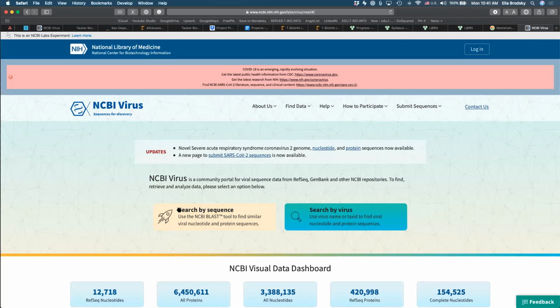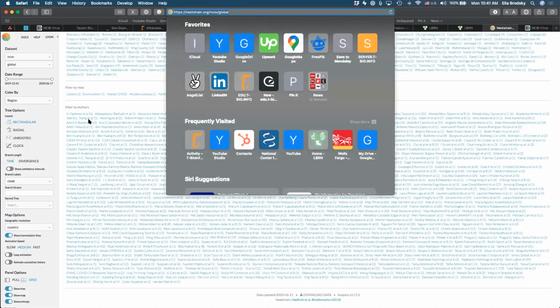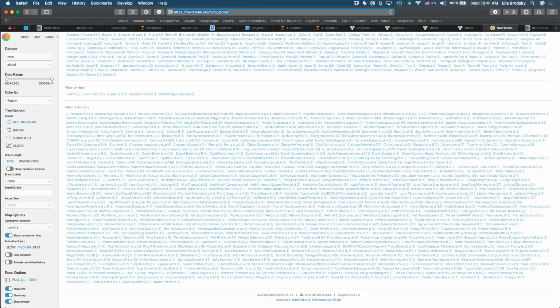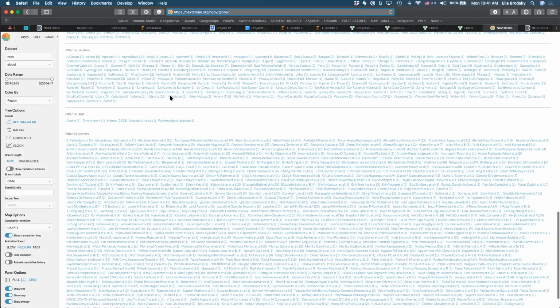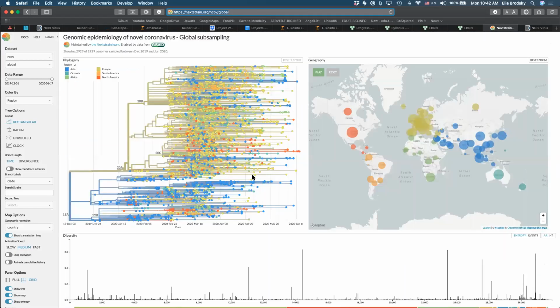Again, a quick question here from Adekunle. Can we get the URL for this page to view the mutations in real time? Seems like Nextstrain? Yes, so this is the link. Okay, so here you just click on play, you can play it, you can see the individual genomes right here.